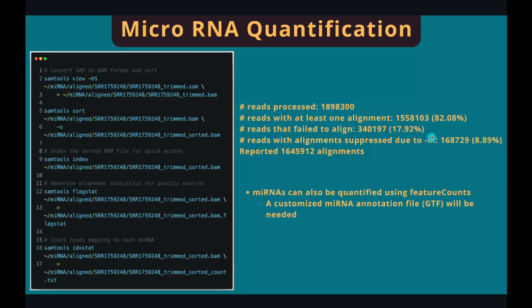It's perfect. And next, we can directly quantify the microRNAs using samtools, the idxstats option. So we can save the result to our output file here.